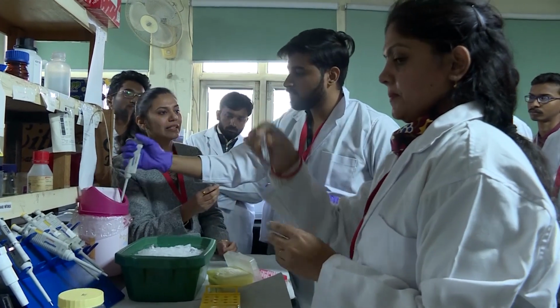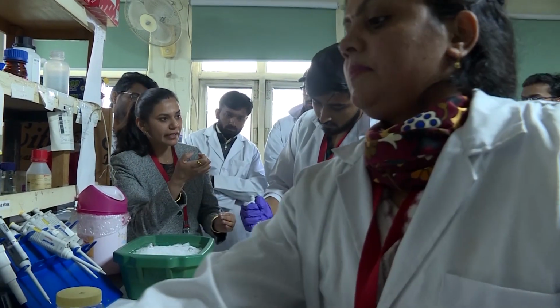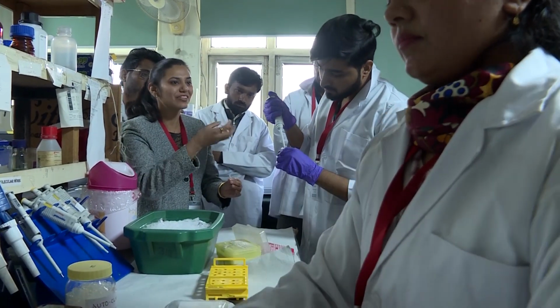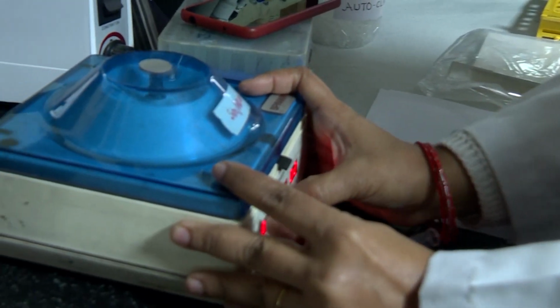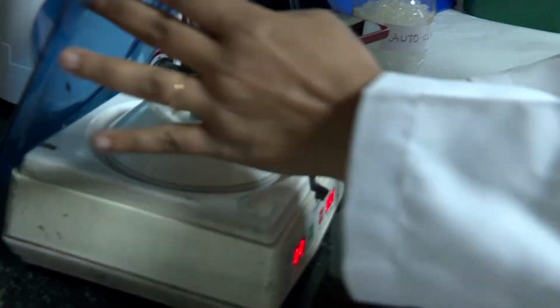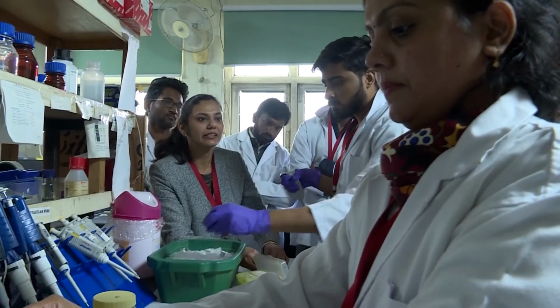Because the amount is very small, whenever you take it, always check your tip whether it is coming or not. Sometimes it does not come into the tip, so always take care that it is there. Okay, so up to primer, our actin gene is okay.